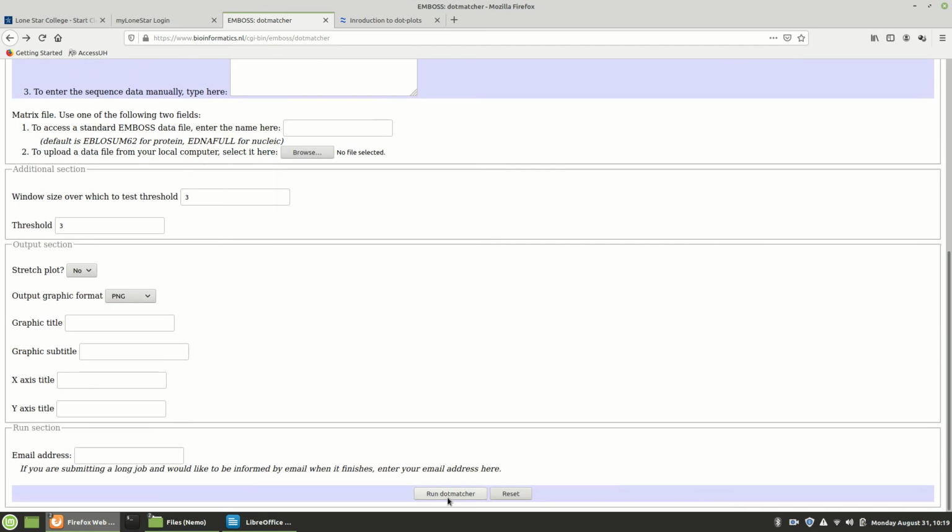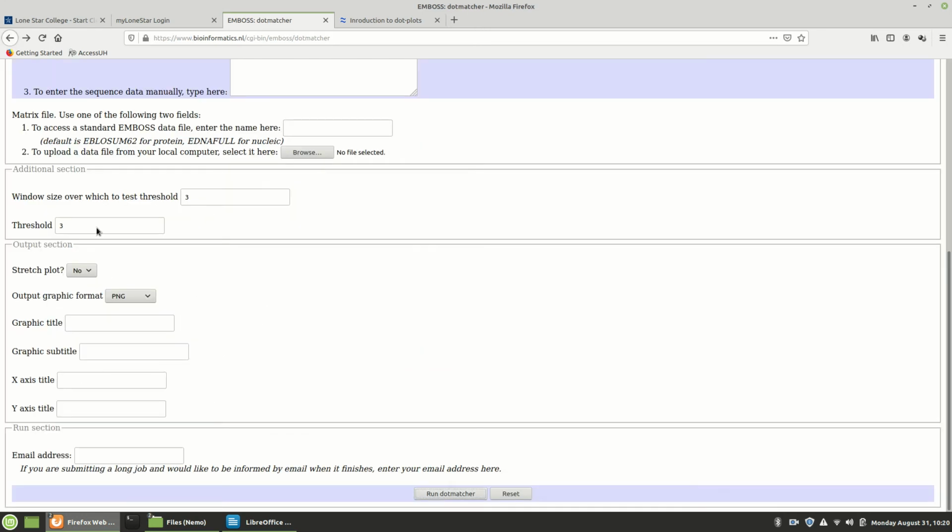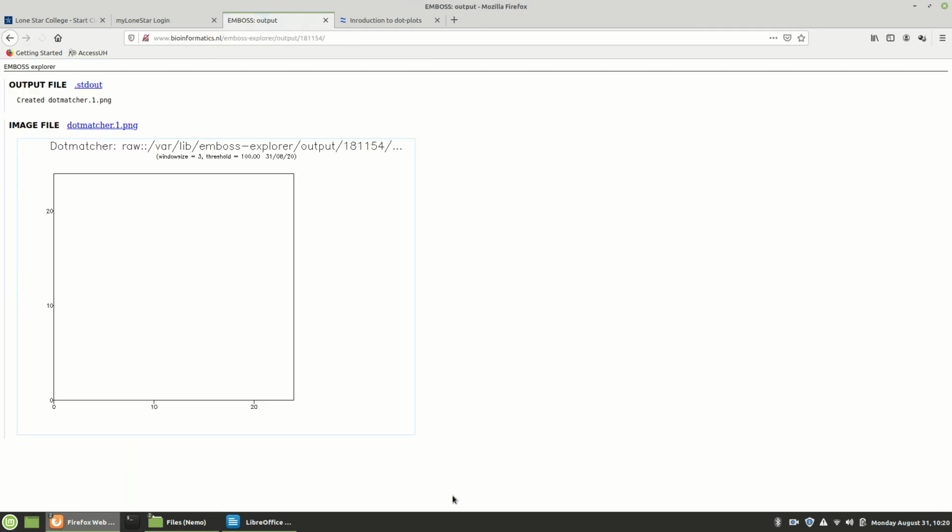How does it look different? Well, it looks the same. And why is that? Or well, it's longer, of course, but because our threshold, actually, I didn't put the threshold that high. Maybe it is like 100. So let's try this. Let's see what happens. Nothing.